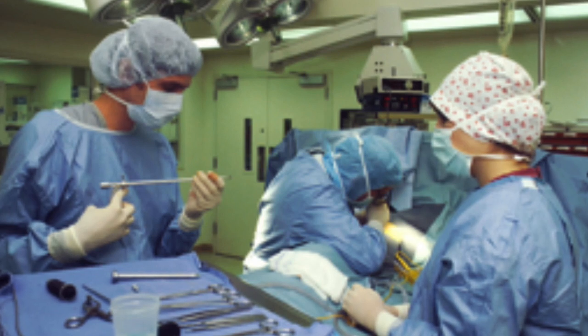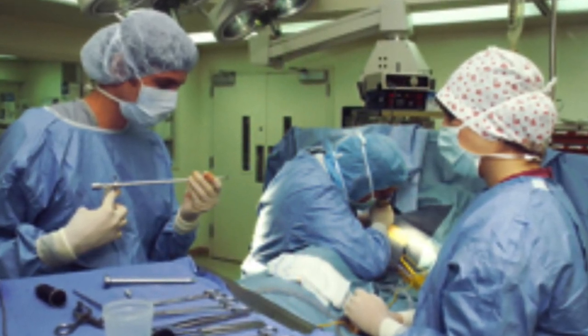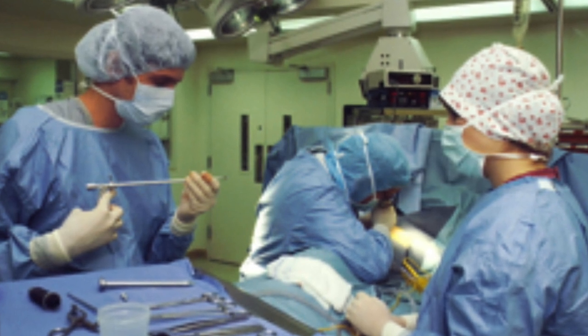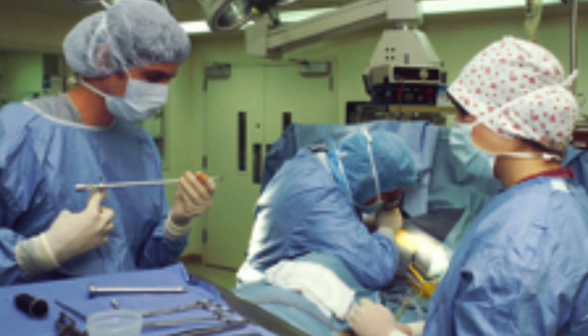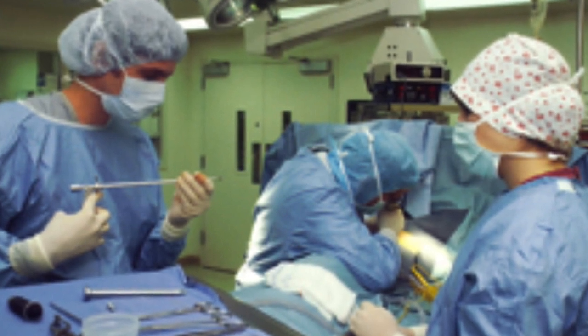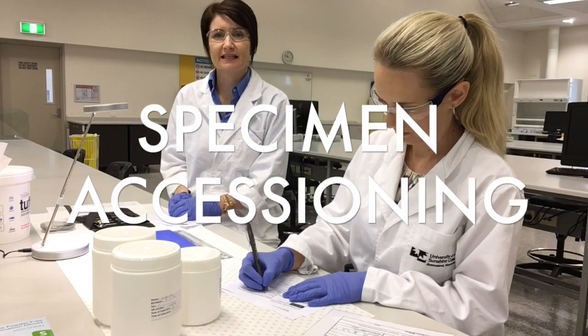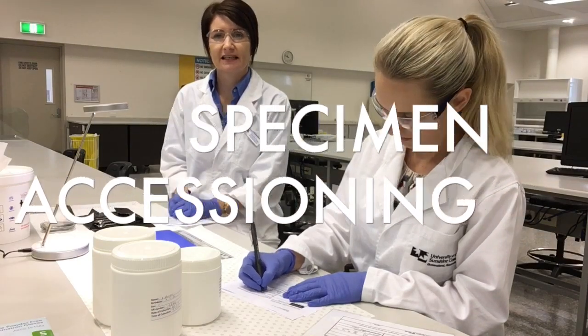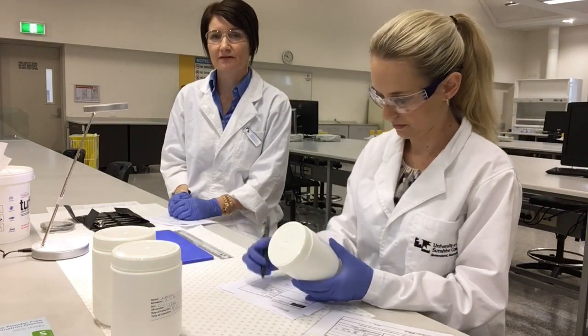Once the tissues have been taken from the body, for example, a suspicious mole, a ruptured appendix, or even a cancer, the tissue needs to be prepared and processed so it can be viewed by the light microscope on a glass slide. The first step in tissue processing is specimen accessioning. This is part of what is called the pre-analytical procedure.